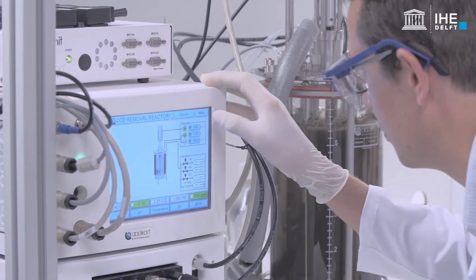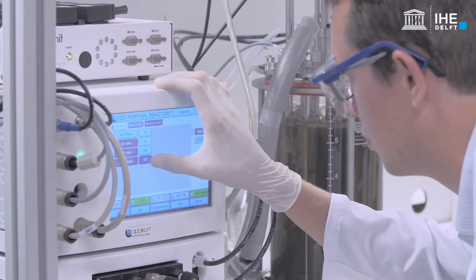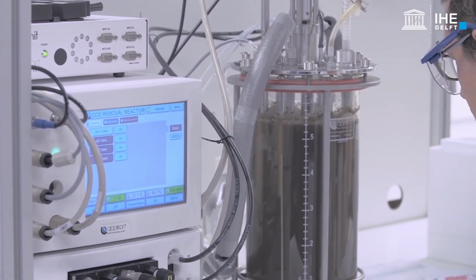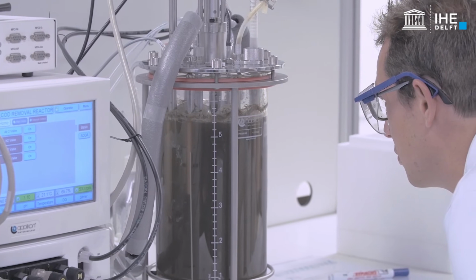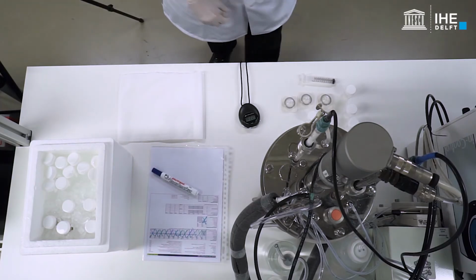In the end of the test, the external aeration can be switched off. This will help to minimise the presence of air bubbles in the samples that will be collected for the determination of the concentrations of particulate compounds and suspended solids.